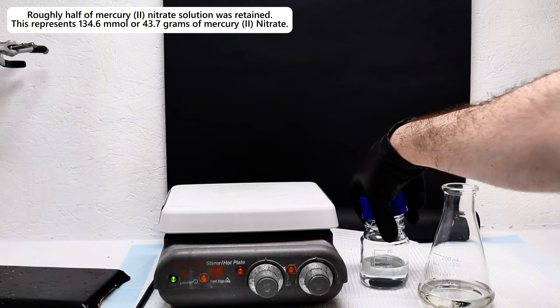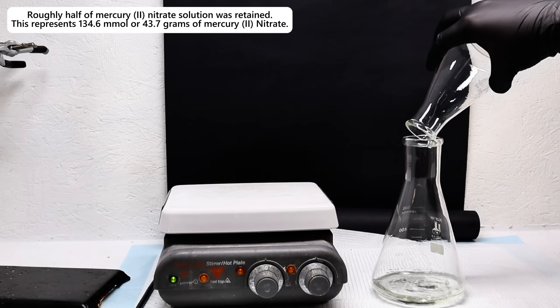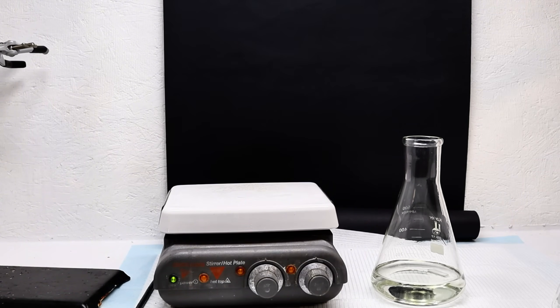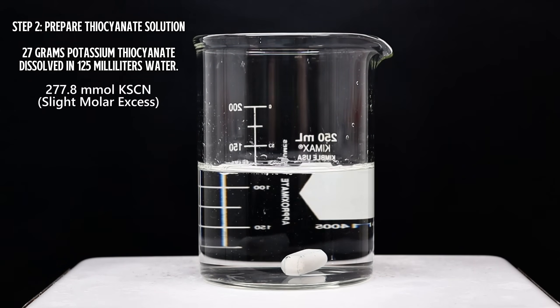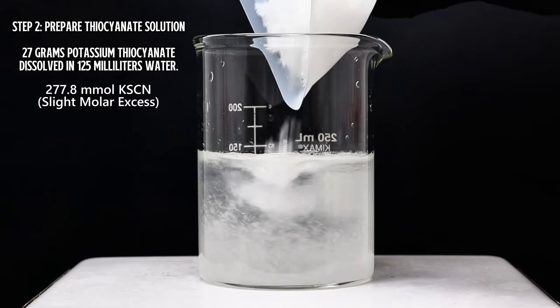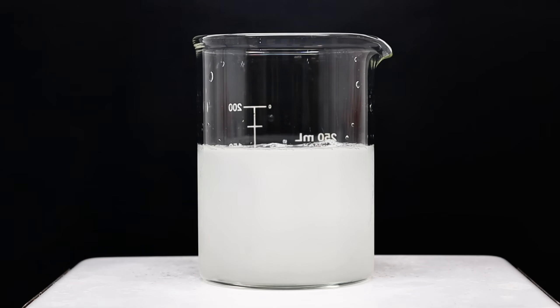I poured about half of this into a reagent bottle to use for some other projects, and then poured the rest into a larger 500 ml flask. I then rinsed my reaction flask a few times with distilled water to remove any residual mercury nitrate and to somewhat dilute my final solution. In a separate beaker, I next dissolved 27 grams of potassium thiocyanate in around 125 milliliters of distilled water. The dissolution of alkali thiocyanates is extremely endothermic, and this causes the temperature of the mixture to rapidly drop. In fact, it quickly gets so cold that you can see water begin to condense on the outside of the beaker.